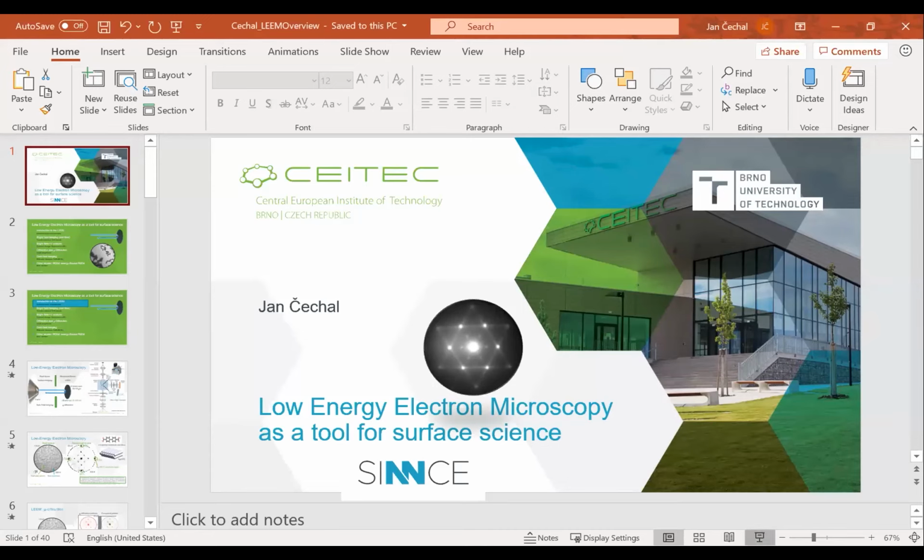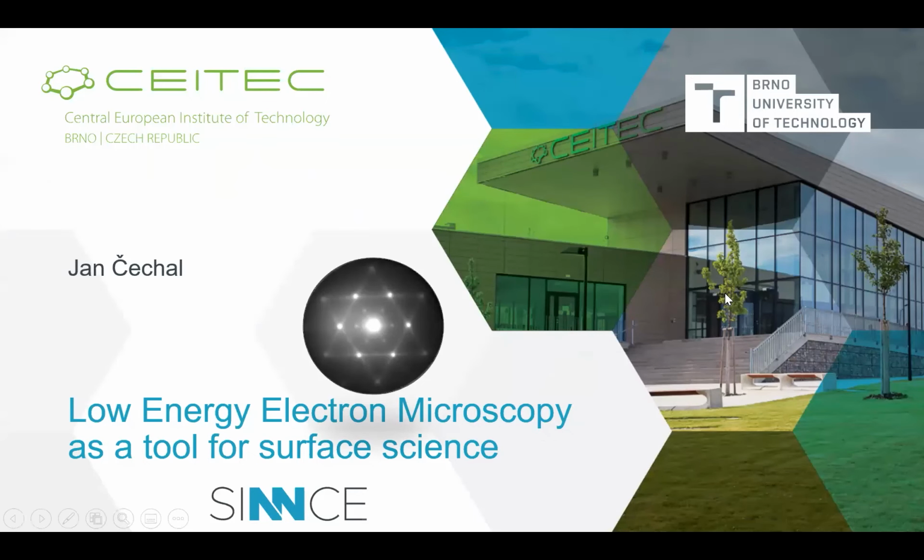Indeed, I have some molecule examples in the presentation, but I will focus on low energy electron microscopy, which I found to be a really amazing instrument to see what's on the surfaces. It complements the very microscopic view introduced by Franz Giesibel, and it goes more to the mesoscale.